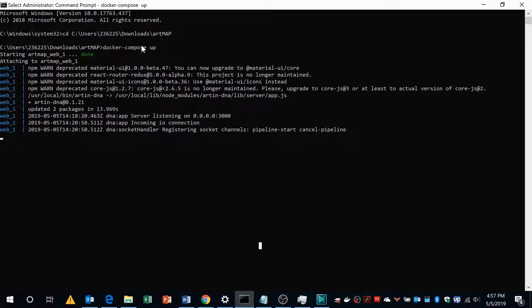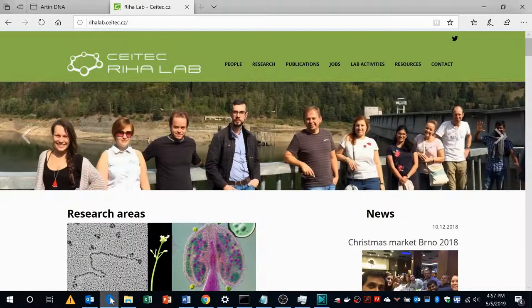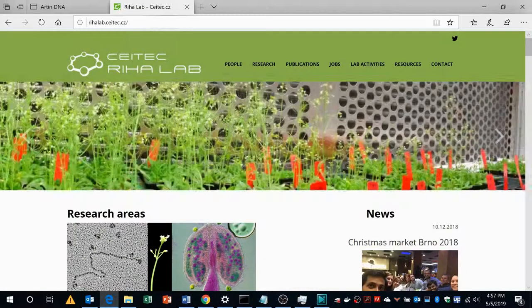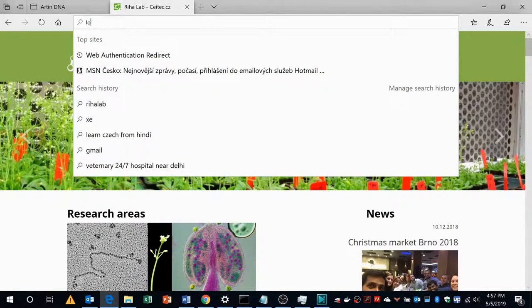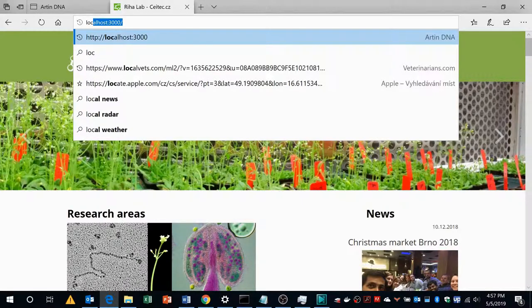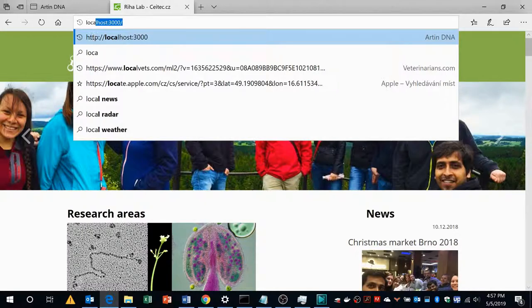After successfully executing this command you will see a message saying server listening on port 3000. So to run Artmap you have to open your browser and go to a URL called localhost:3000.